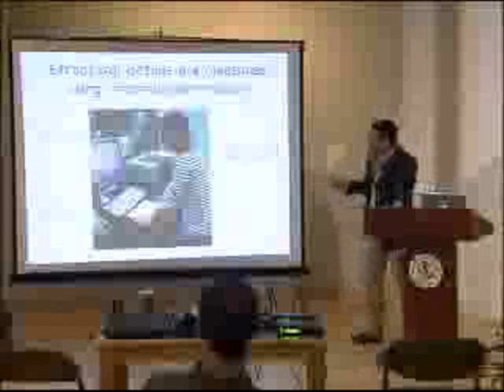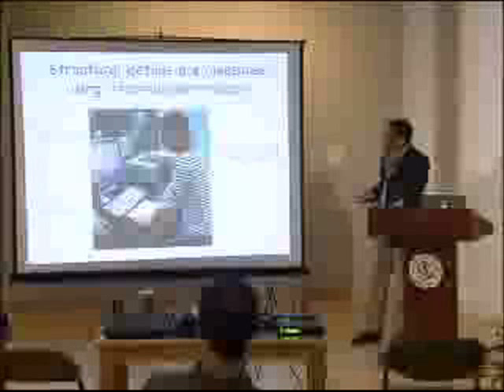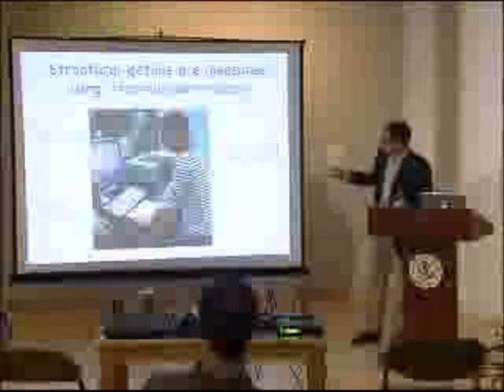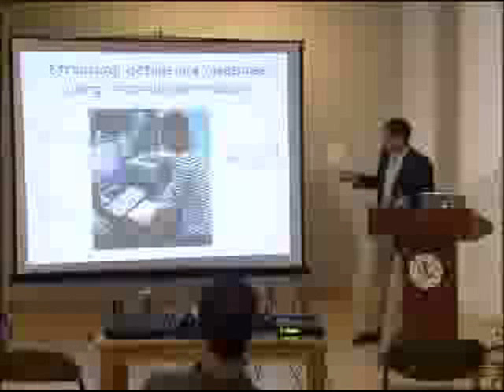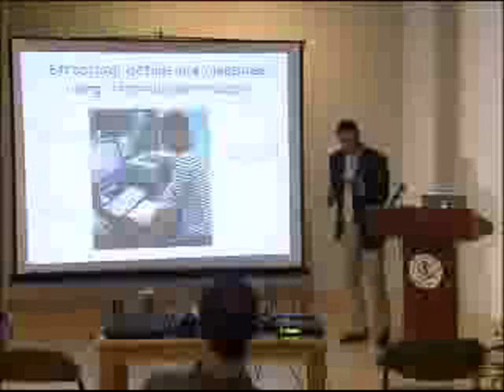So this is another student from the lab, Amy Dubuque, who graduated last year. And she's standing next to our infrared spectrometer, which is right here. We're not very neat in lab, so it's got lots of tape on it. So what does an infrared spectrometer do?